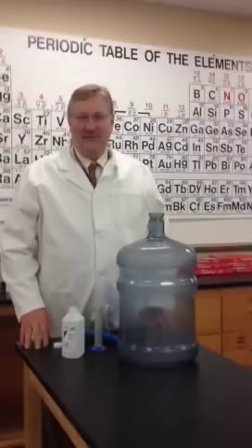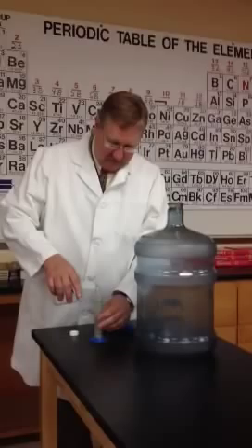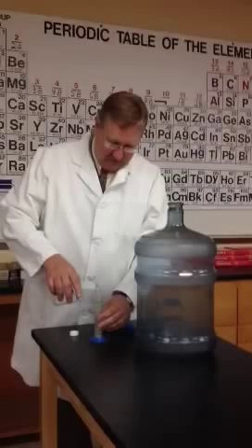Do not do this at home. I am a trained professional. First, we pour in 45 milliliters of 70% isopropyl alcohol. Put it into our carboy.